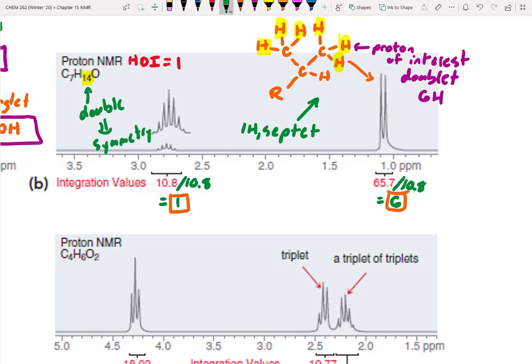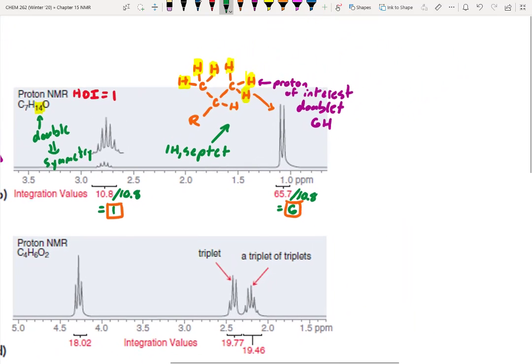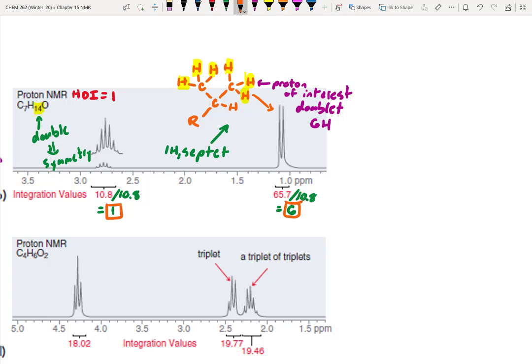Yeah, that's a good question. So right now we're only focused on the symmetry of the protons, because that's what we're looking at for the NMR, is just protons. All right, but that's a good point. Where do you think the oxygen would be in order for it to be symmetric, though? It would have to be in the middle, right? Okay, so let's make sense of this. Okay, so we've got symmetry. Over here, this whole thing is really what we would call an isopropyl group, right? Make sense? We know we've got two of these.